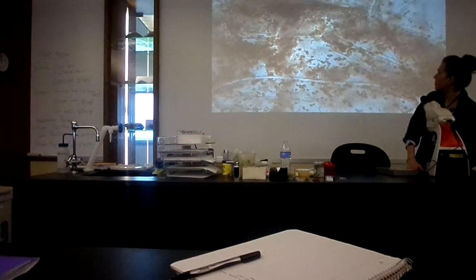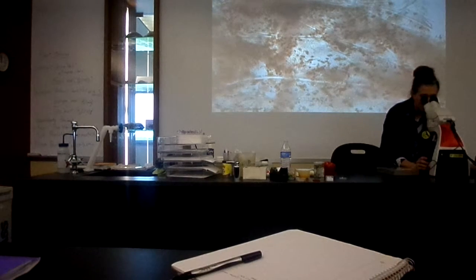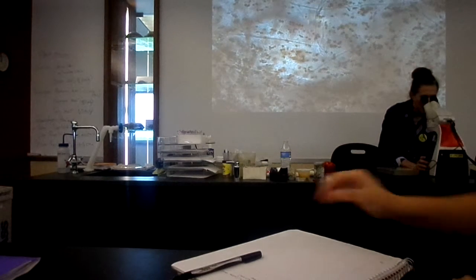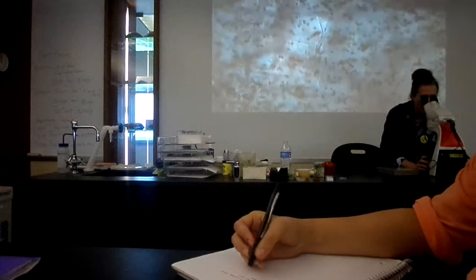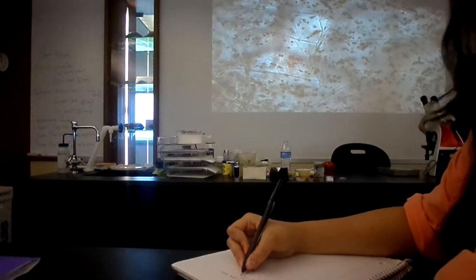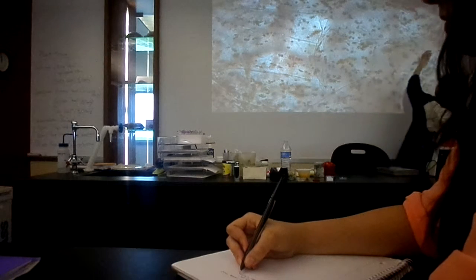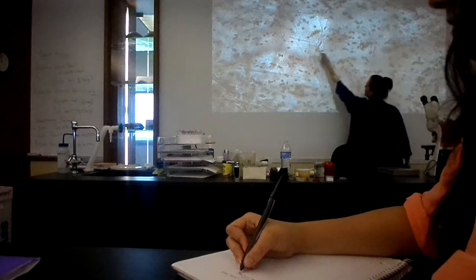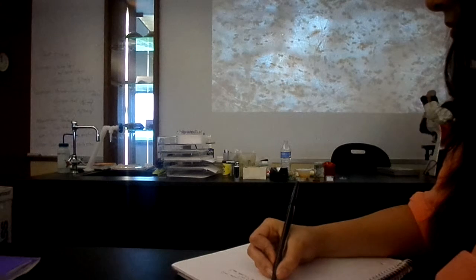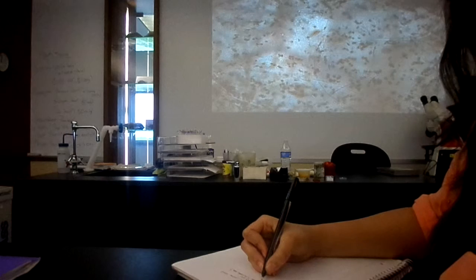All right, so look, guys. We're looking at a layer of tissue. Parenchyma. Okay, so here's what I'm going to try to outline, maybe a cell. It's really kind of hard to see where a cell is, but maybe right in here is one cell, but you can see here that I'm overlapping it with another cell, right?